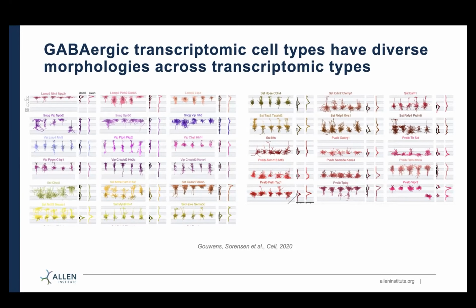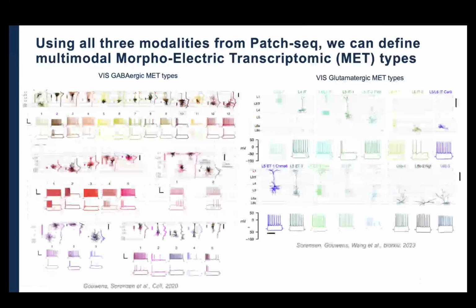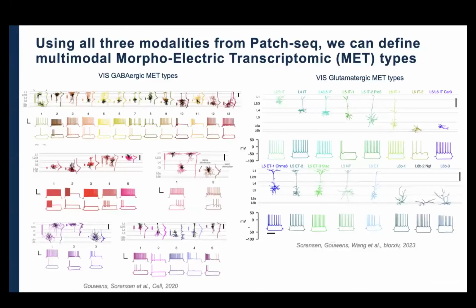And I just want to point out that I'm now showing our visual cortical data set. If you look down at some of these SST neurons that are here in yellow and orange, you'll see that they have some similar shapes to the motor cortex interneurons that we looked at, like Rachel mentioned. Okay, so if we now go to the next slide.